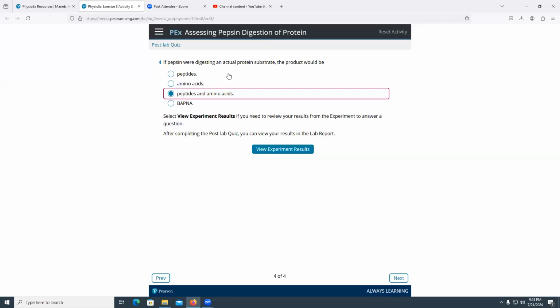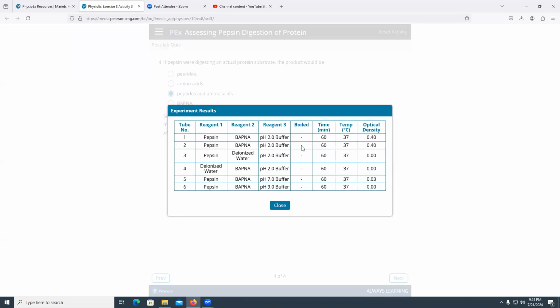So sometimes you have polysaccharides plus monosaccharides. Sometimes polysaccharides, disaccharides, and monosaccharides. Sometimes polysaccharides, even more polysaccharides that are smaller than the main polysaccharide, in addition to the disaccharide and the monosaccharide. So it's definitely peptides and amino acids. I really want us to look now at the results.